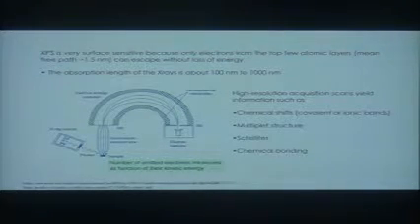Now you might say, I wonder if there's enough electrons coming out, because after I've filtered or focused and had a slit for the electrons that came out of my sample, how many could possibly be left at the other side of all of this, right? Especially in a small energy range. Because I'm adjusting the voltage on the bottom and top plates of my analyzer so that only a certain number of those electrons actually reach the detector. That's a very difficult proposition. So what you have to have is a detector that's very sensitive.